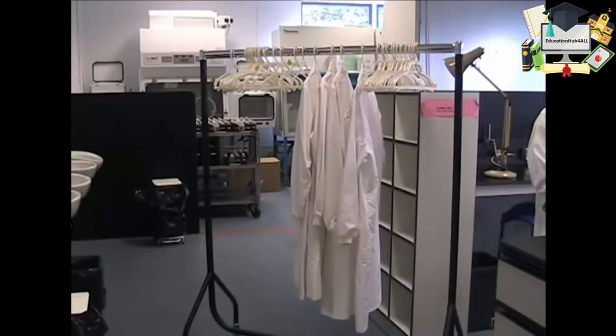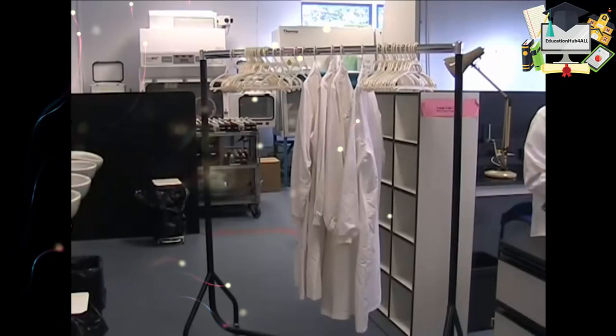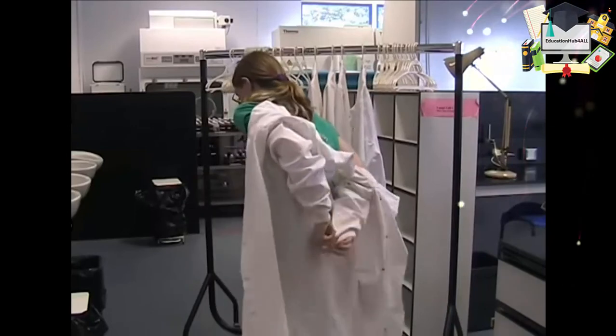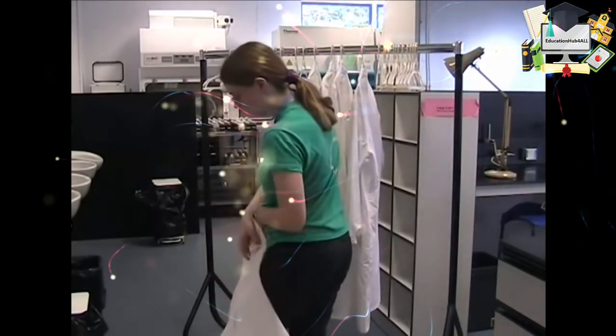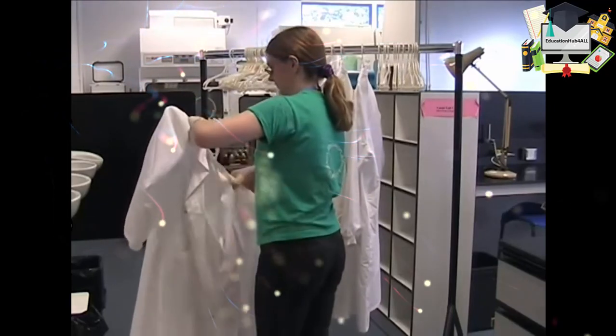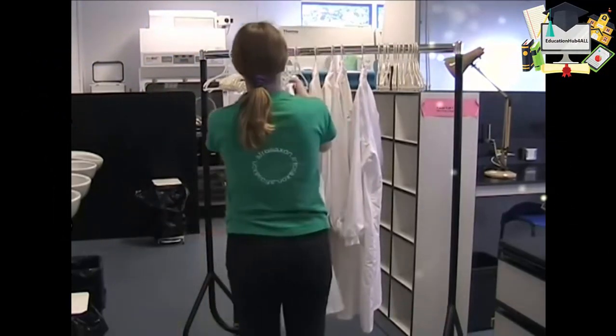The last thing to do at the end of your practical is hang back up your lab coat and wash your hands. Always remember to remove your lab coat first to avoid recontaminating your hands when you take it off. Hang it back up on the hanger and then you're ready to go.